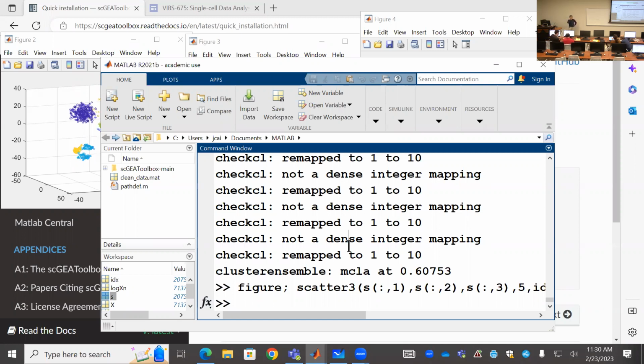I think for the rest of this half hour, I will use the real example data set to show you, okay, we can do SC3 clustering first, then annotate the cells, and then we can do k-means first, then annotate the cells. Let's see what we can get, okay? Some practical solutions. I'm going to close everything.